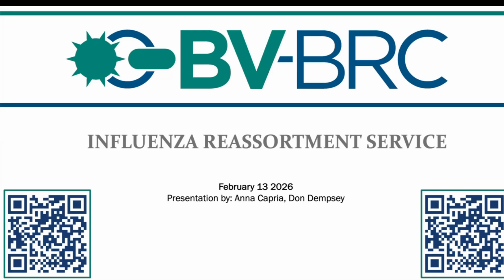And so today I'm going to talk about a new to BV-BRC service, our Influenza Reassortment service. Typically, if you've seen any of my presentations over the last few years, I go through how to actually step through it on the BV-BRC. Today I'm going to just stay in the presentation, but in the folder for this example, I have each step that I took in a written tutorial format. We'll see how that goes, and if that's something that we want more of, we can do more of that in the future.